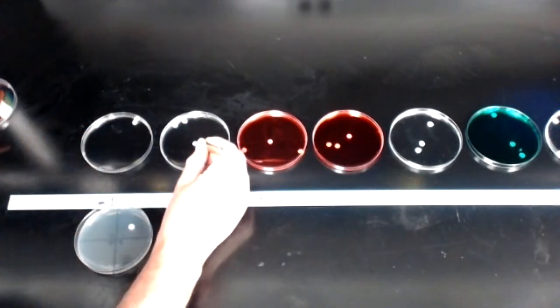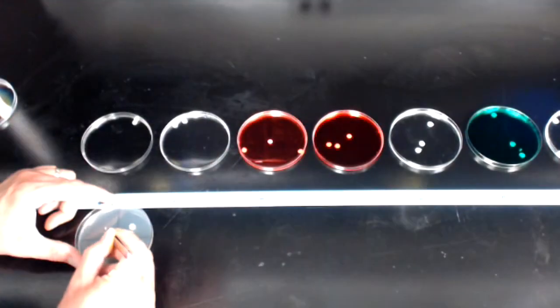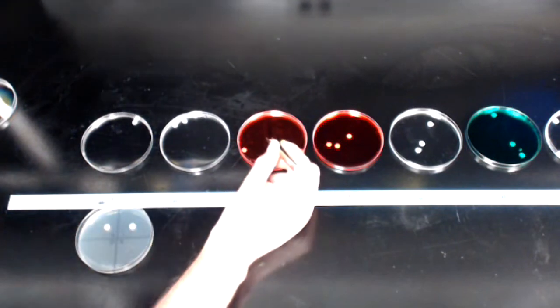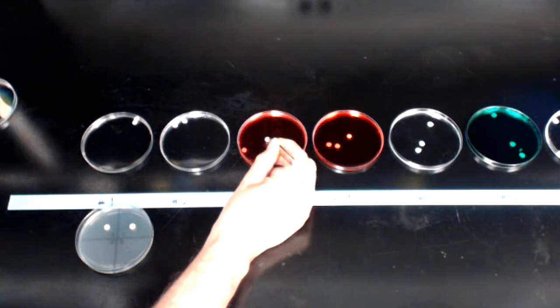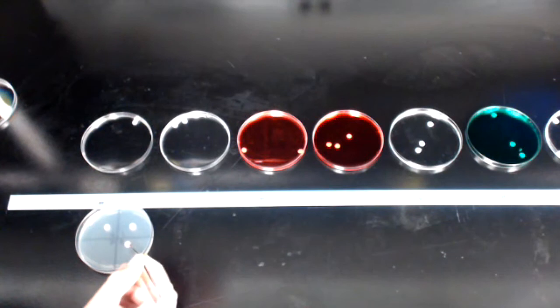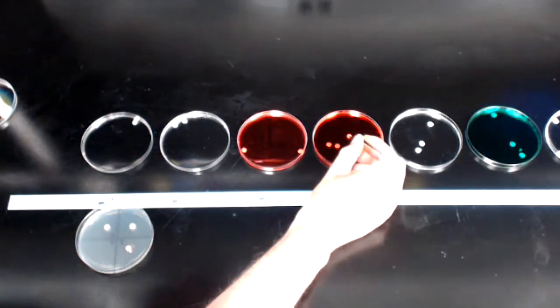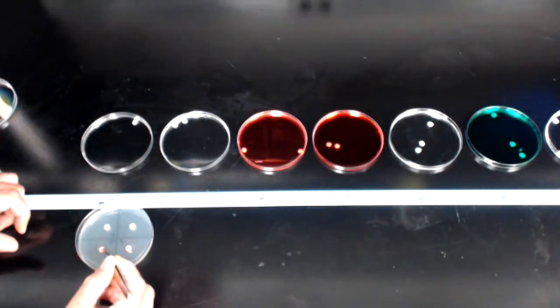I take the next disc, this one from dish number 2, and I put it in the middle of the number 2 quadrant. I take the disc from dish number 3, put that in the number 3 quadrant, and I take the disc from number 4 and put that in the number 4 quadrant.